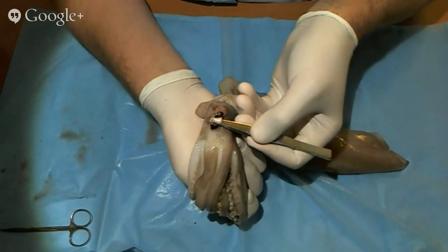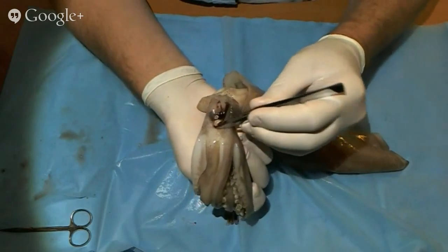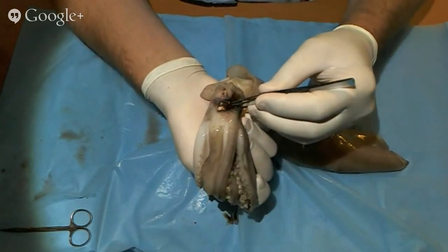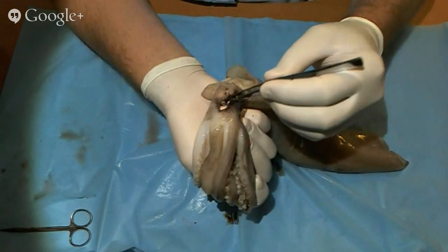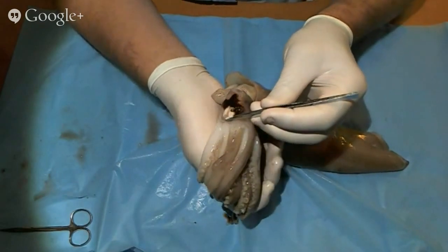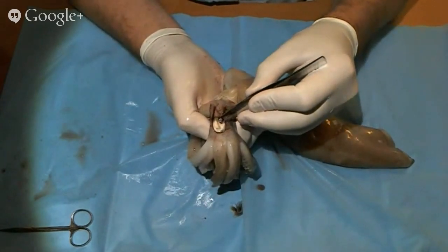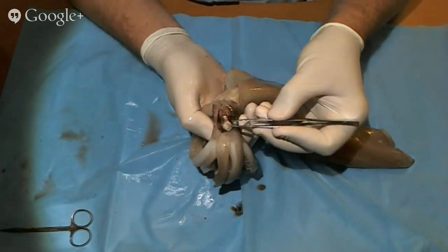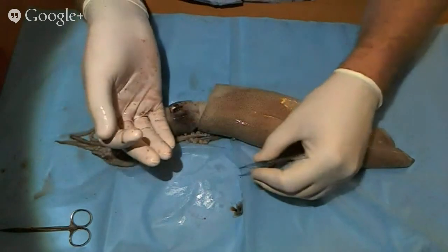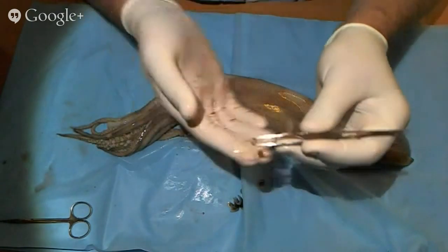So I'm trying to pull this out as gently as I can without cutting it, but you can see kids kind of like this, some of them. This is where I wanted to show the coloration too. Notice it's the same color as the chromatophores. I think personally that the squid does a very good job of recycling all of its proteins. So the proteins that are being used to make all the different pieces, including this eyeball, once you can get that out, then the students can have a look at the lens of the squid's eye under the microscope as well.